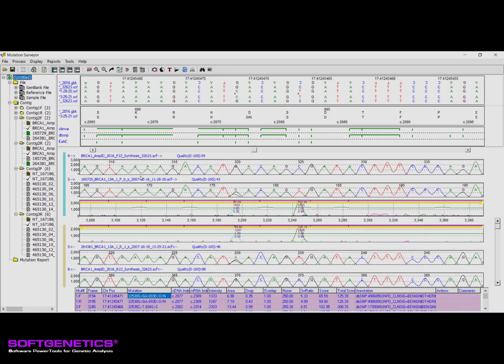The software performs a physical comparison between reference and sample at every peak location, looking at factors such as peak height, area, color, and noise in the region, and indicates any differences with the peak in the mutation trace. The larger the peak, the greater the discordance. The color of this peak represents the type of nucleotide change detected.